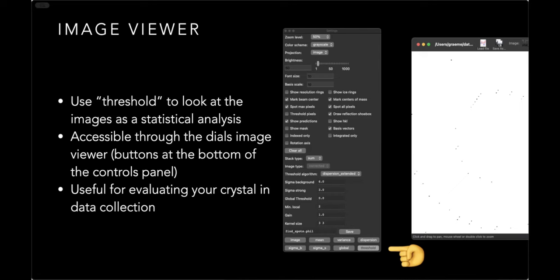Great. Thank you. Transitioning to something slightly related, you'd mentioned the library of information for the metadata for where you've collected something. I apologize, that was a barely coherent question. Is that just a matter of editing parameters like the formats and the distances and the rotation directions, or is that more involved if you've got a new source you need to bring in? So if you've got a new source you need to bring in, let's say for argument's sake that you've got a vertical goniometer on your source and you've got your detector on a 2-theta stage, to pick a random example, right?